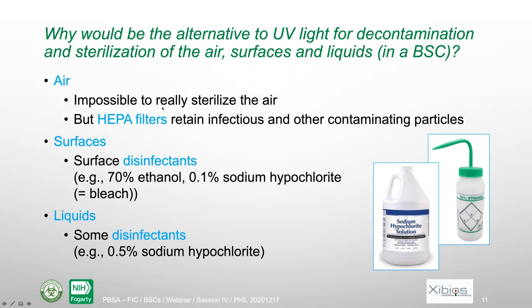So there is no real sterilization or inactivation, but HEPA filters will retain the infectious and all the other contaminating particles. So for the air, we really count on HEPA filtration. For the surface, we can use surface disinfectant like 70% ethanol or 0.1% bleach. And for liquids, we can also use some disinfectants, and the most used is also bleach, usually at a higher concentration.